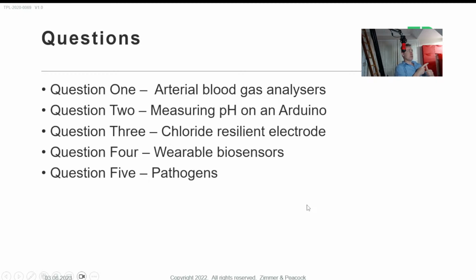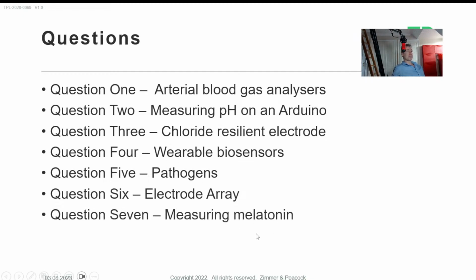Pathogens: I've identified the gold electrode, I've identified the connector, I've identified the Anapod EIS, I've identified the cable. Literally, it's time to start putting samples onto that system and looking at the data first of all. Electrode array, I didn't have a great answer on this. We don't put drawings on the website, but you can purchase it and take a good look at it that way. We have the EMMA. The EMMA will only measure 6 of those electrodes, so you may end up having to build your own electronics to drive that. We have built our own electronics in the past. I put a page up on it, and a link, but it's not something we're supporting. It's just something we did in the past.